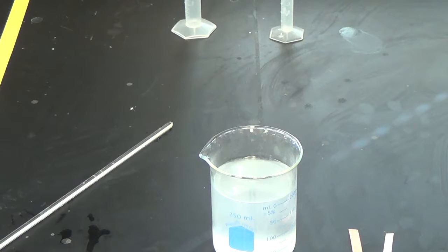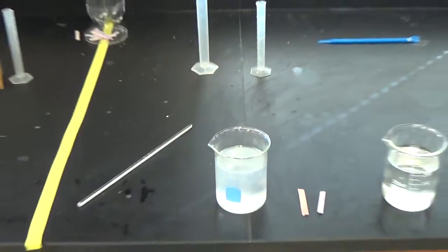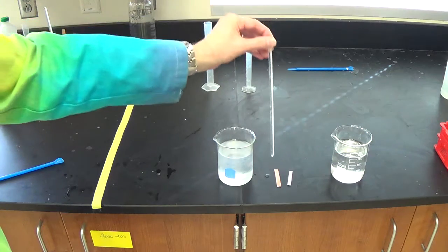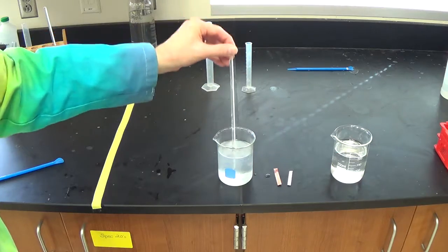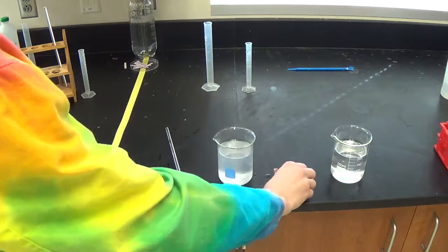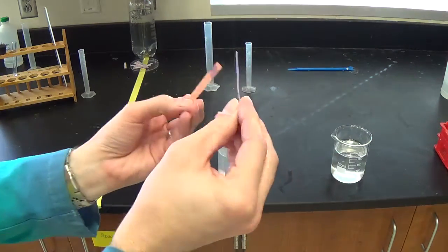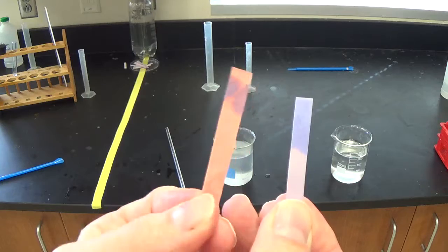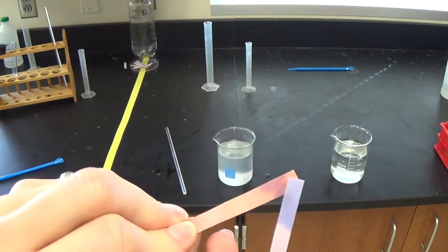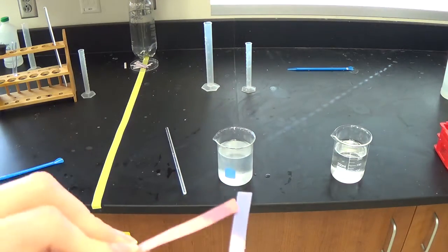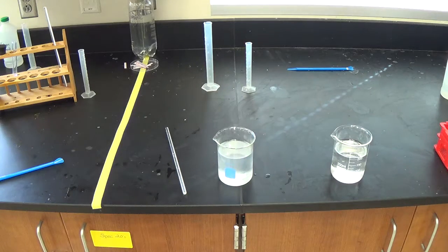Now that the reaction is obviously finished, we're going to retest the litmus paper. I have two new strips of litmus paper. I'm going to take my stirring rod and dip and tap onto my paper. Now we see that the blue paper stayed blue and the red paper is turning blue. This combination of blue on both is indicating that we have a base.